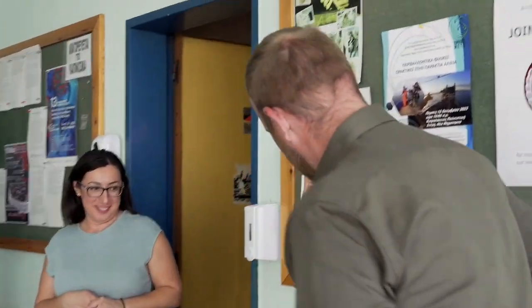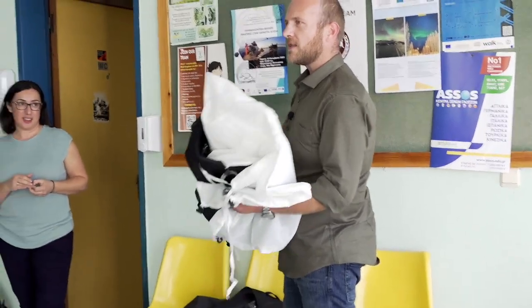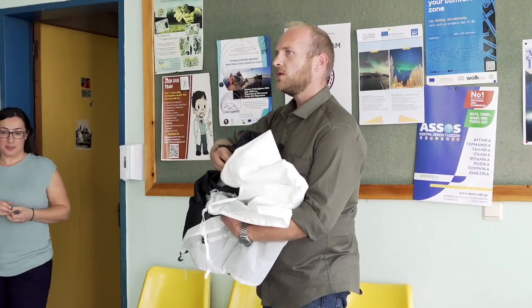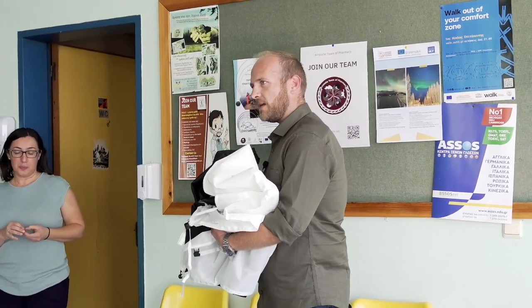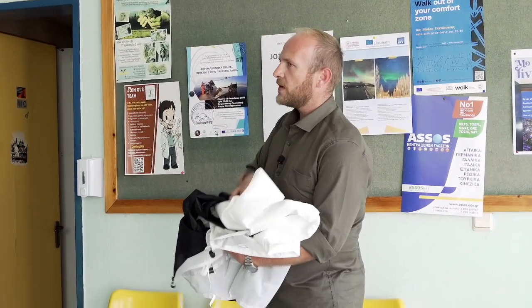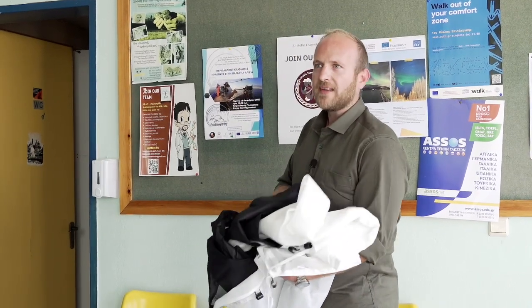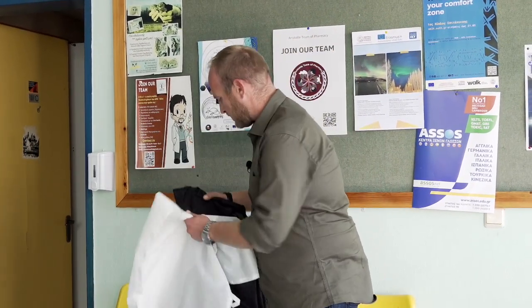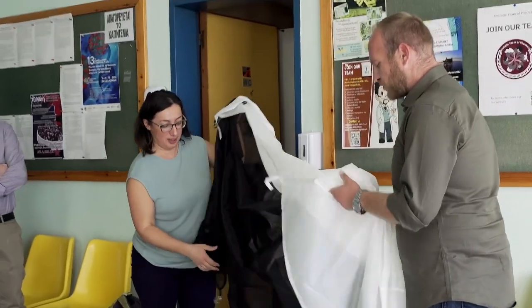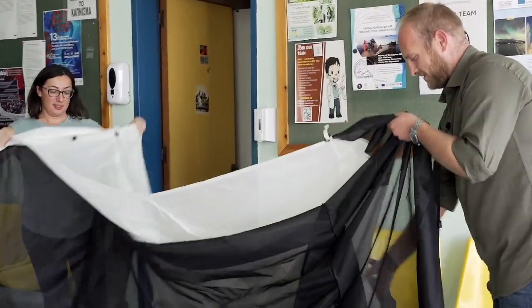So, Malaise trap. I have to say that a Malaise trap is not just this shape, the tent trap, or this color. Many kinds of traps with different shapes and different colors belong to Malaise traps. But this is the one that most entomologists use because it's the most effective one. Unfortunately, this work requires two persons to do it.